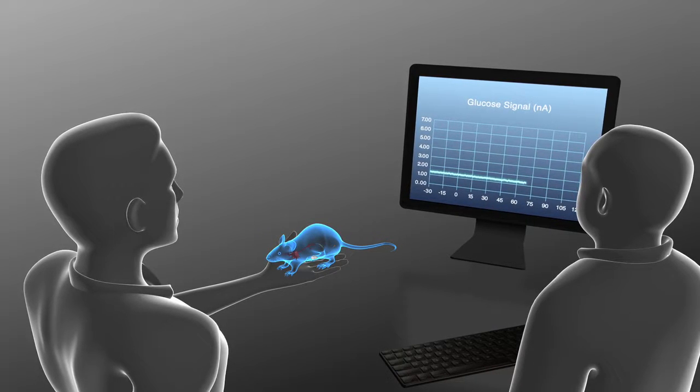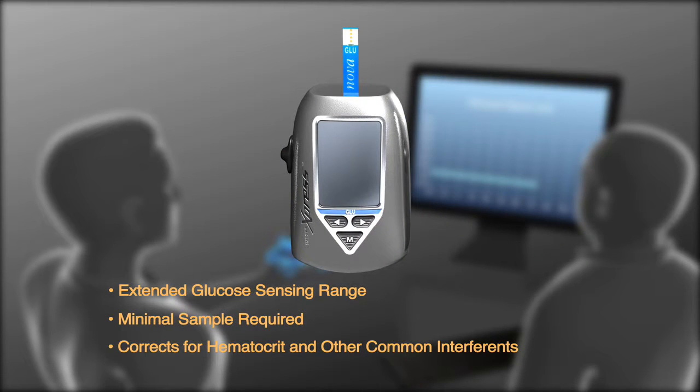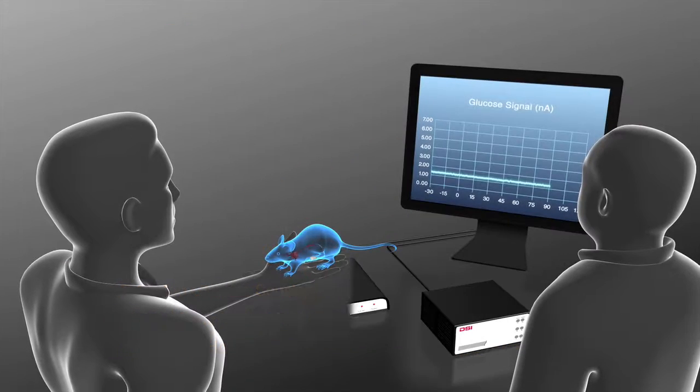Prior to calibrating your implant, you must select a calibration reference. DSI recommends the Nova Stat Strip Express meter and test strips.